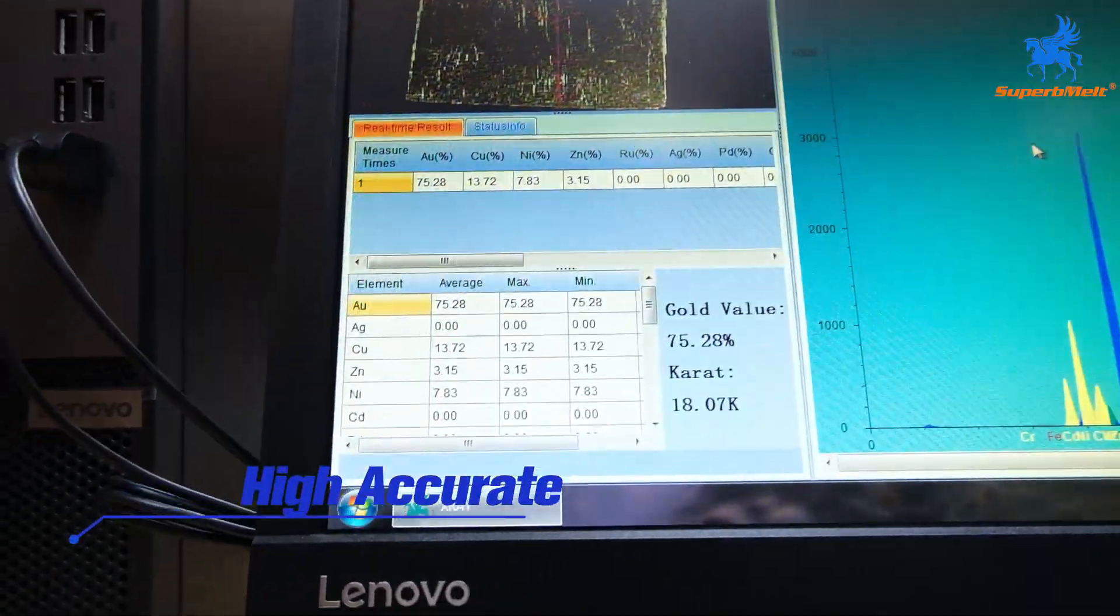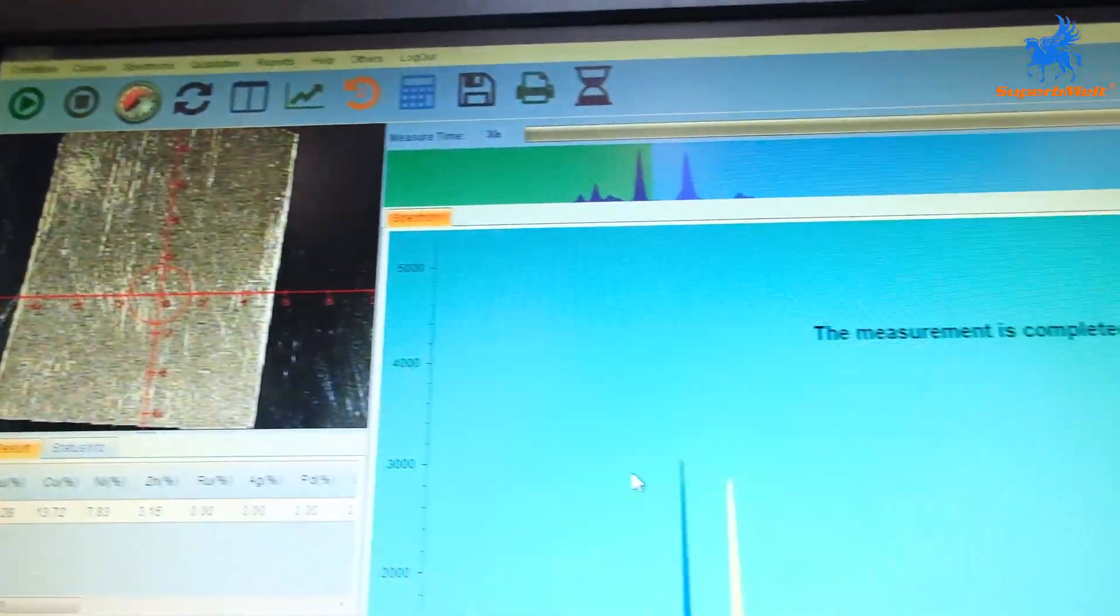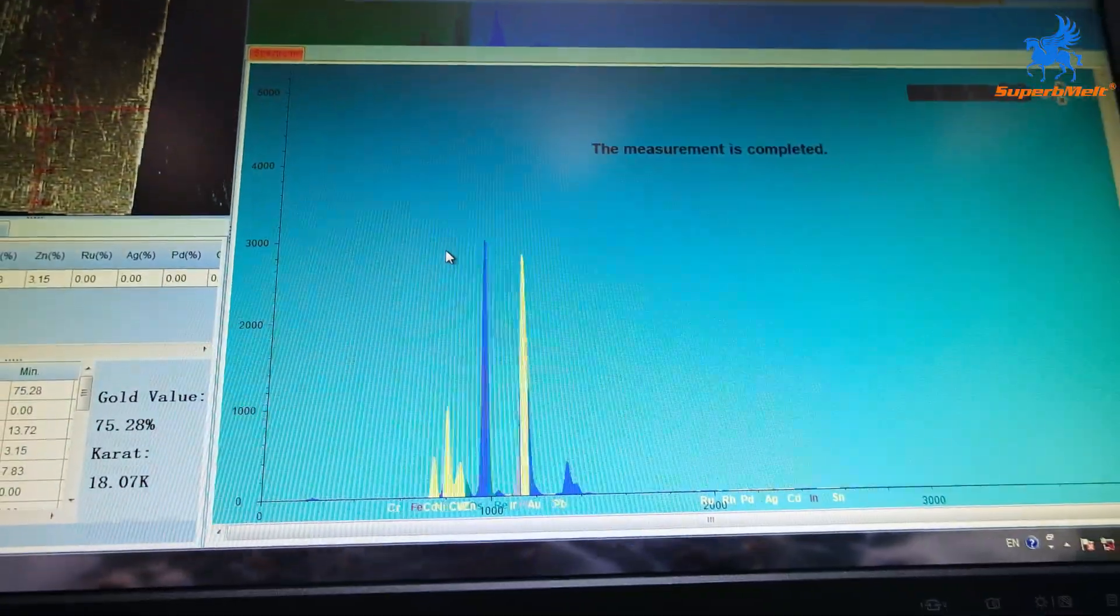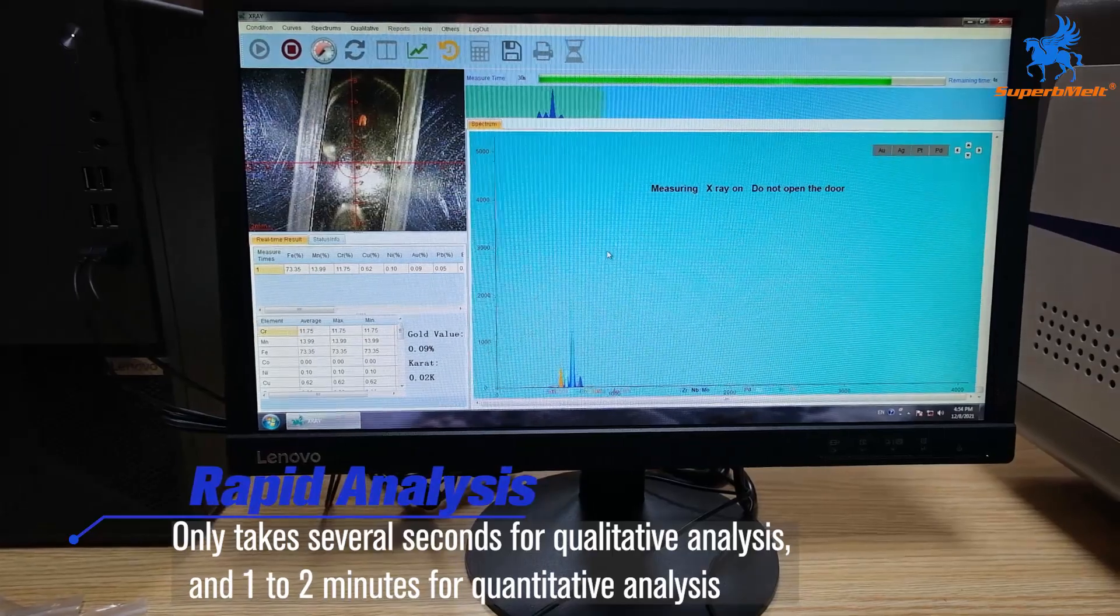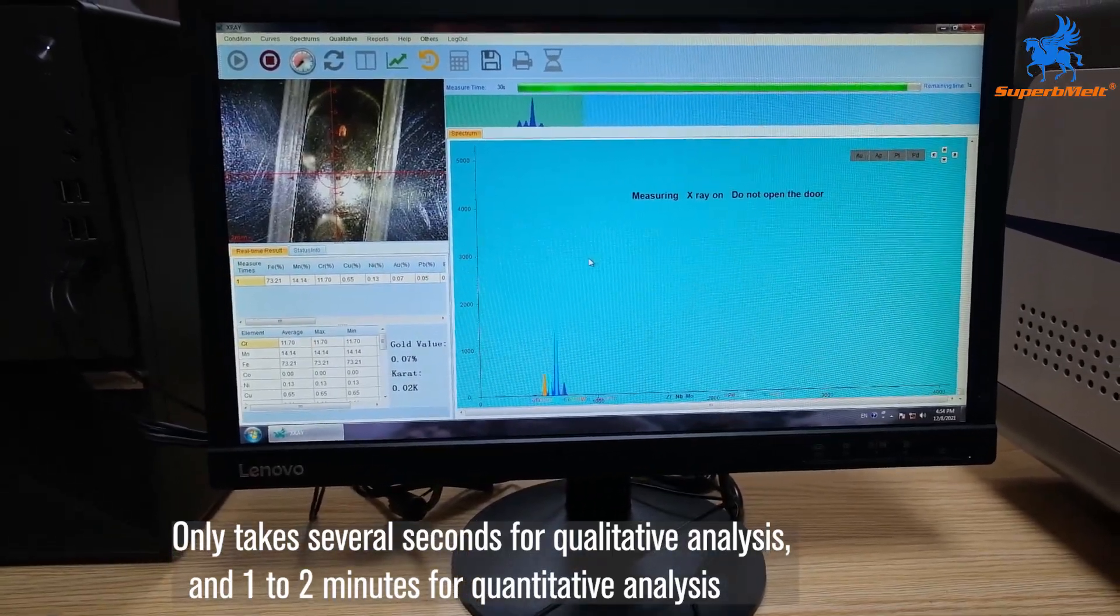High-accurate analysis results close to fire assay result. Rapid analysis only takes several seconds for qualitative analysis and one to two minutes for quantitative analysis.